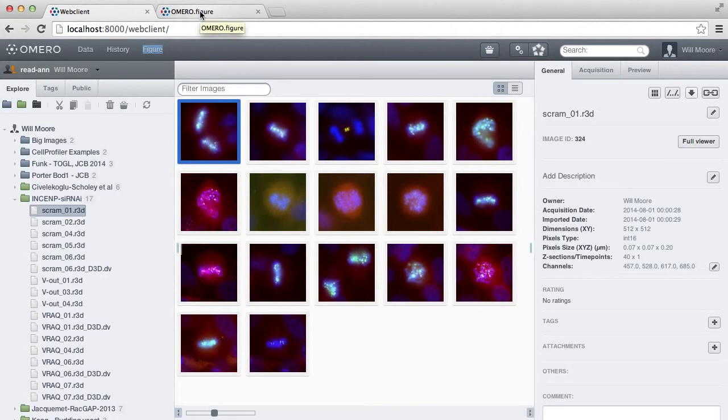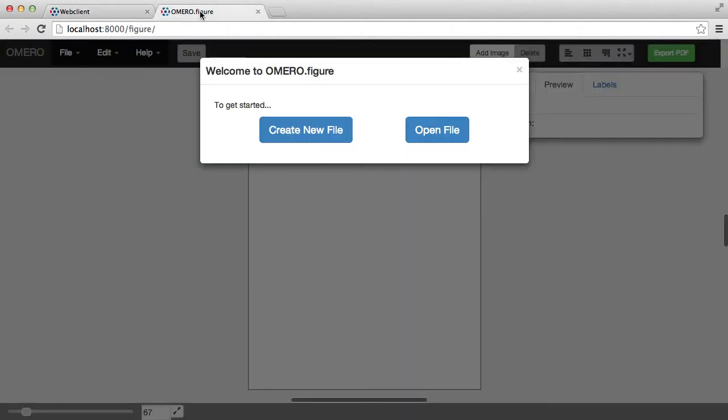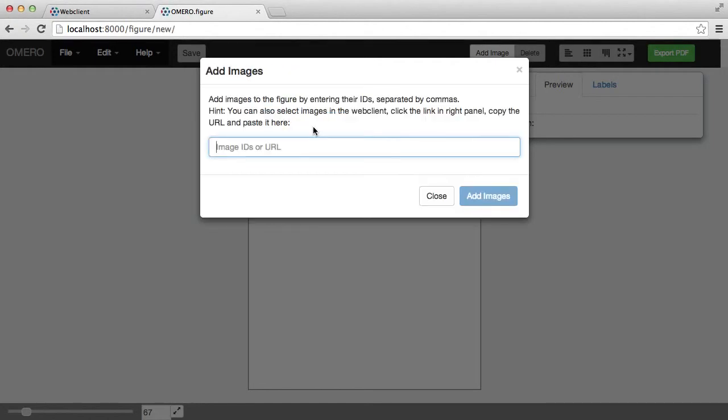If I go to the Figure tab, I'm going to choose the option here to create a new file, and I'm in the Add Images dialog here, asking me for image IDs to bring the images from OMERO into the figure.